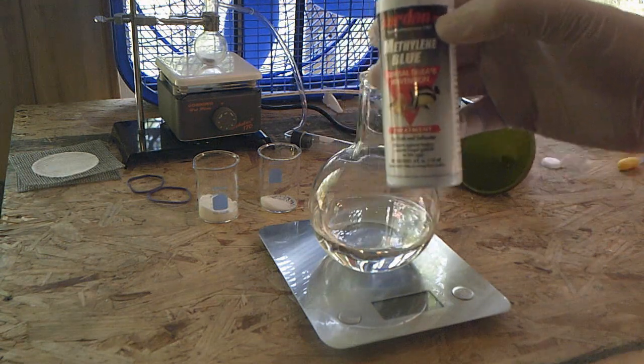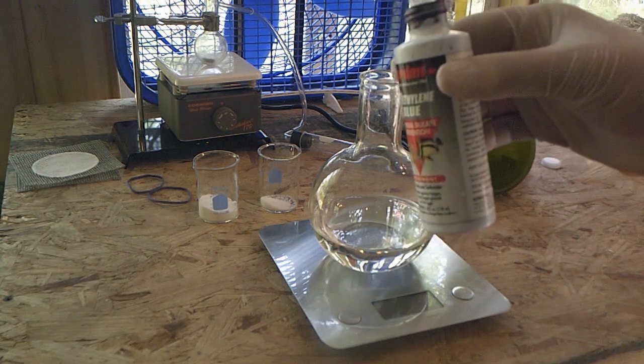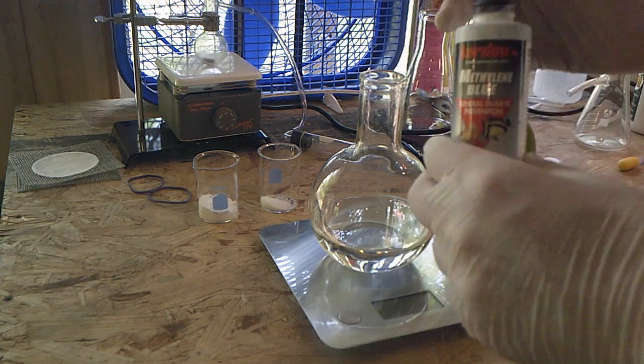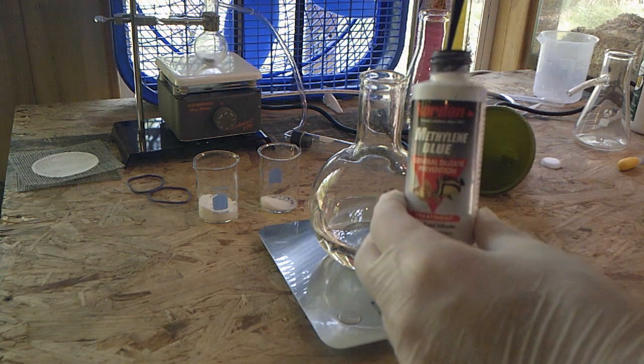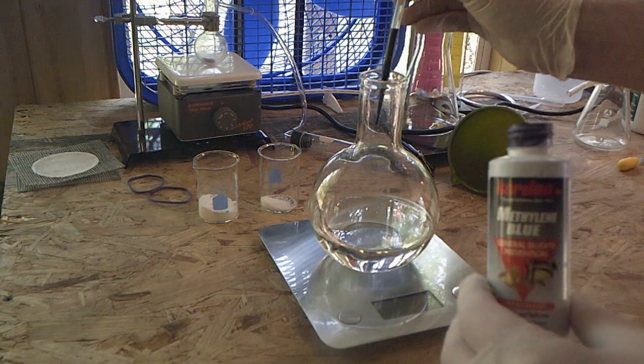and that's going to be something called methylene blue. This stuff is used to clean aquariums because of its antibacterial properties, but it's also a good indicator, meaning it changes color depending on acid and base composition. And so this chemical is going to start off giving us a really beautiful blue, but after I mix it with the other chemicals, it's going to go back to clear.